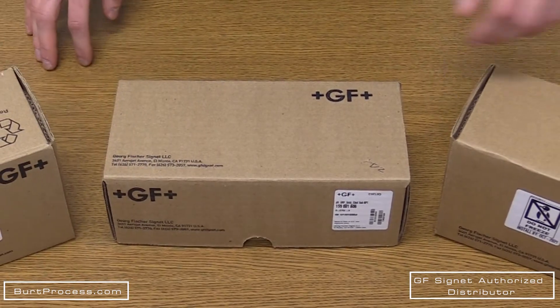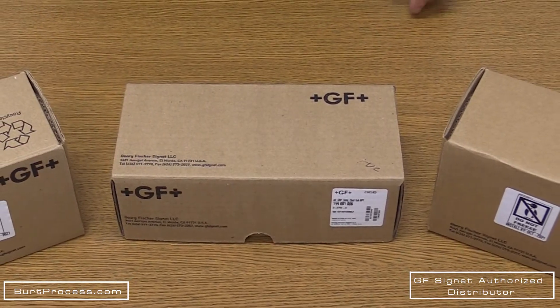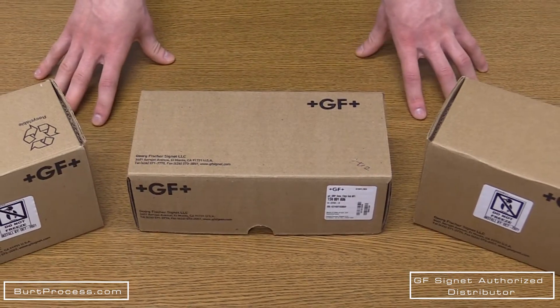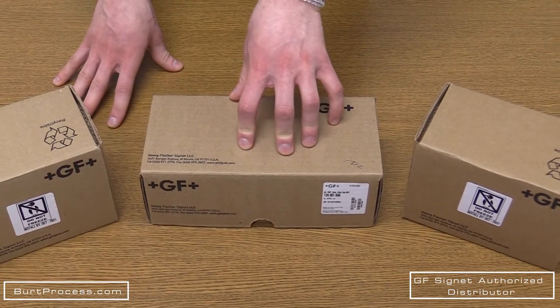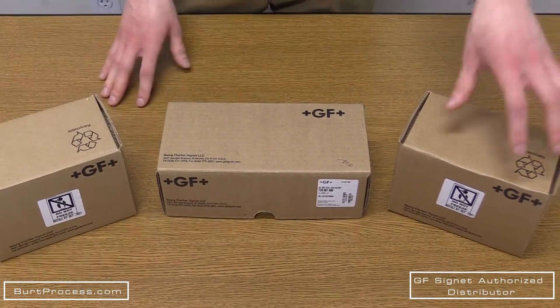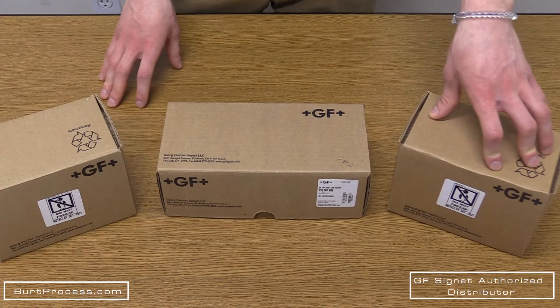Today we are going to be unboxing three different products from George Fisher Signet. Let's get to it. Here we have the products: the 3275-1 submersible smart sensor electronics, the 2724 flat style electrode, and the 2726 bulb style electrode.